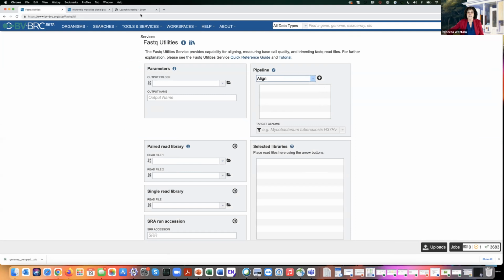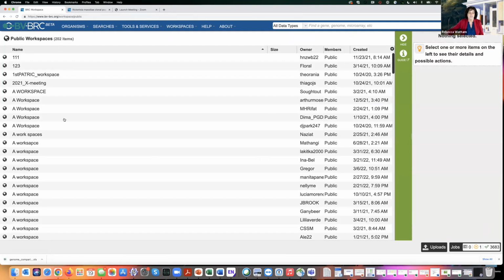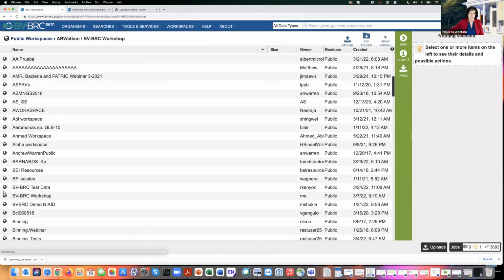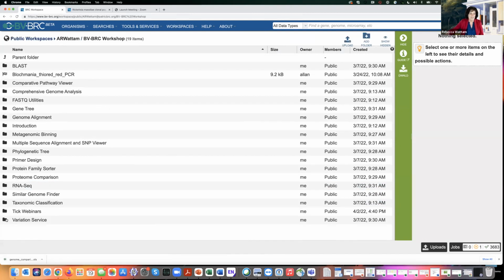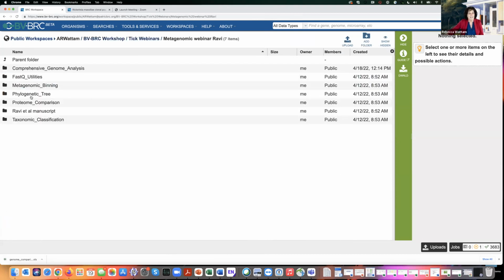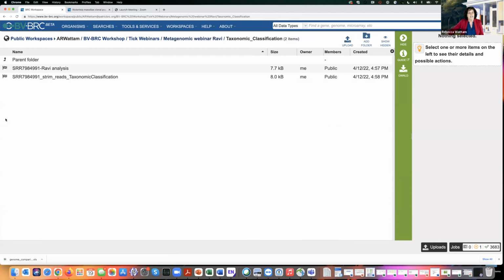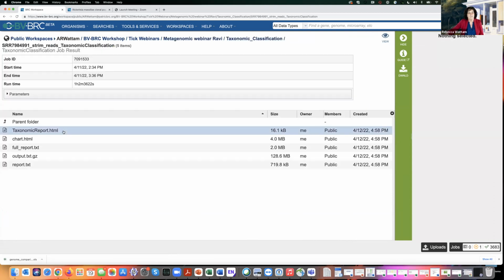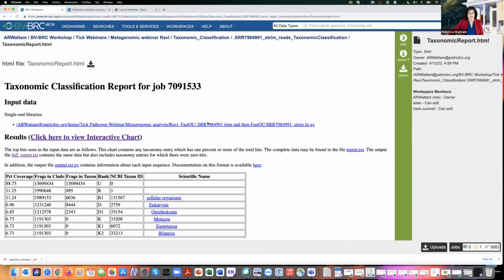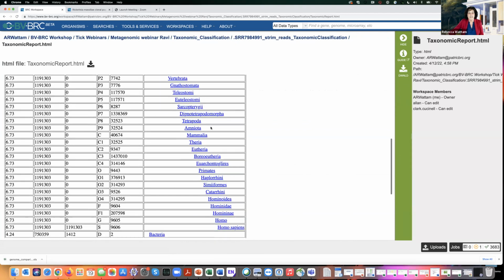Because remember the taxonomic classification, let me go back to that public workspace. Sorry, I know you all are sick of it, you're probably going to hear it in your sleep tonight. BV-BRC, tick webinars, metagenomic webinar. Okay, so when I'm in taxonomic classification and I'm looking at that job, the report gives me an indication of which genomes are in there.